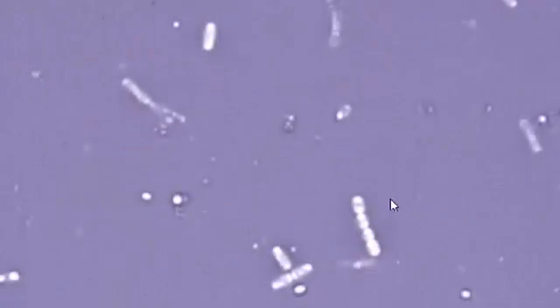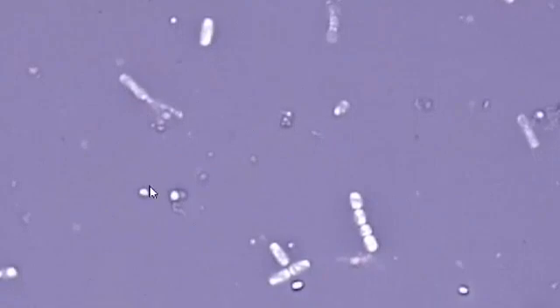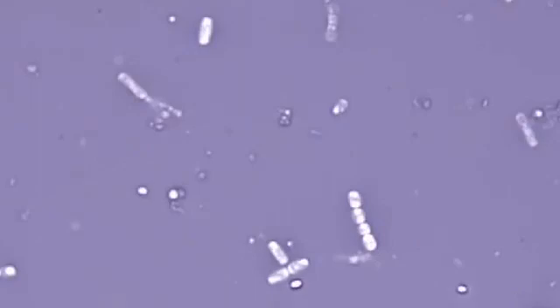Once again, it's easier to see now since the stain is around the outside. This here, where they look like circles, those are actually cells that are turned on their ends. So if you look down a bacillus, it looks like a circle, even though it's not. Here's some bacillus here, there. Some very nice cells for this stain.